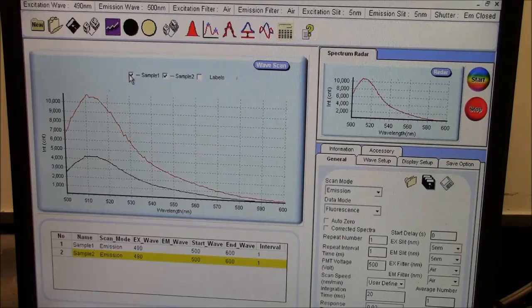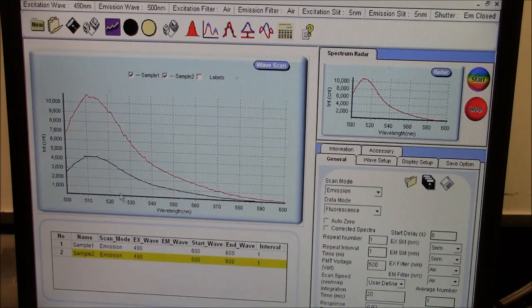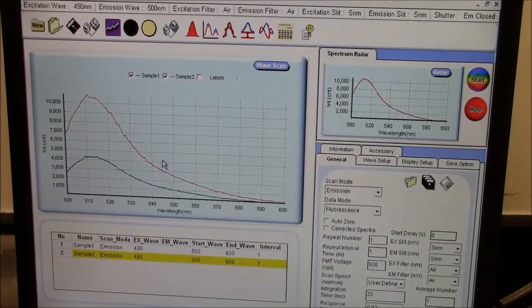So now I have two samples, sample 1, sample 2. This is the one with a higher PMT voltage, and you can see it made a big difference in how many photons were collected. This is above 10,000. The peak last time was about 4,500. If I want to look at only one of these, I can remove one from the graph, get rid of sample 1 by clicking there, bring it back by clicking there. So sometimes you want to run comparative spectra, and that would be how you do it.